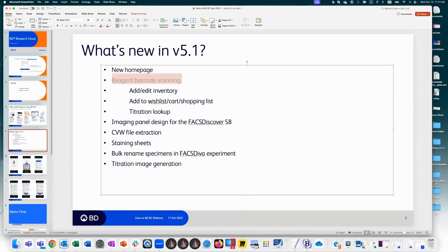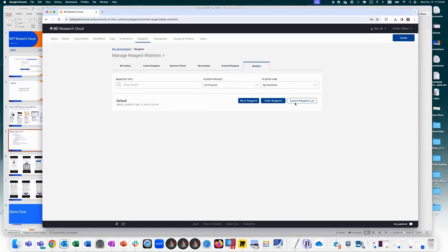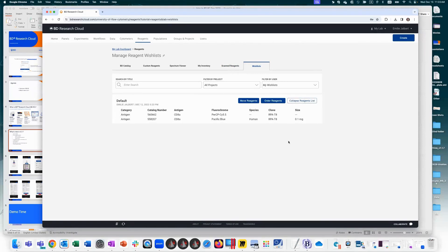From a scanned reagent, you can add to inventory, add to wishlist, or delete the scan. Adding to wishlist puts it on your default wishlist page. Each user has a default wishlist, and you can create additional wishlists based on different project budgets, moving reagents between lists as needed.